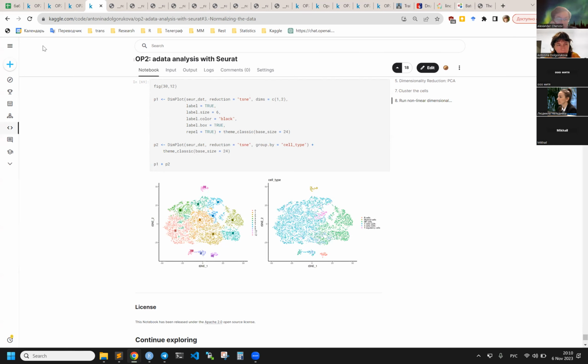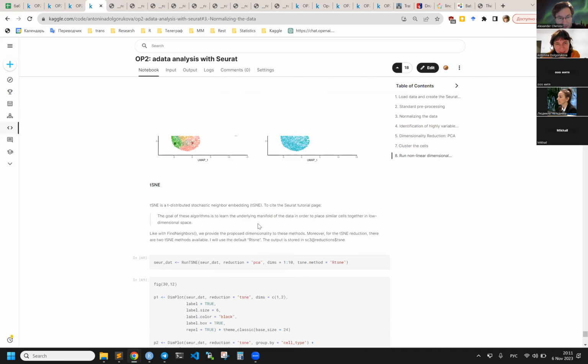But for now, these features with target encoding, meaning averaged effect by cell and by drug, are the best working compared with all other features I tried here. But maybe we can figure out some better features for cells.